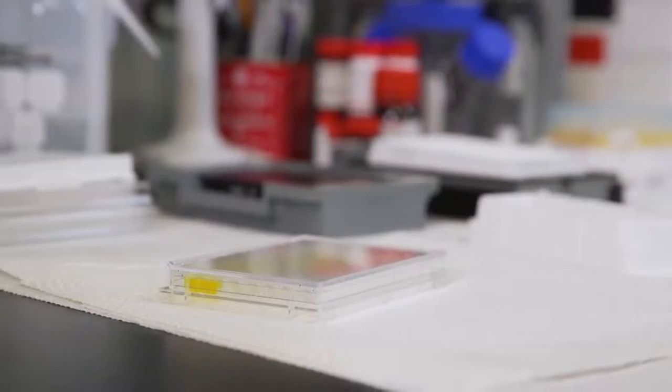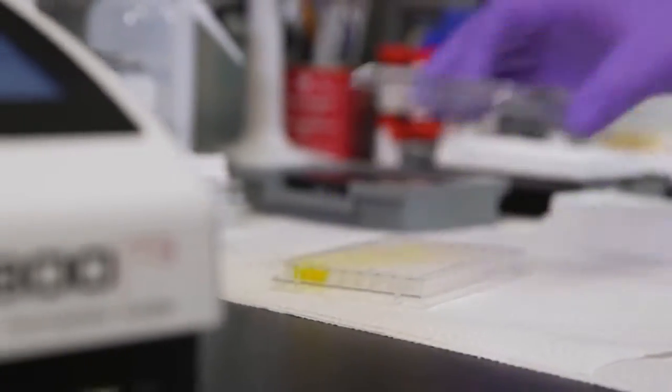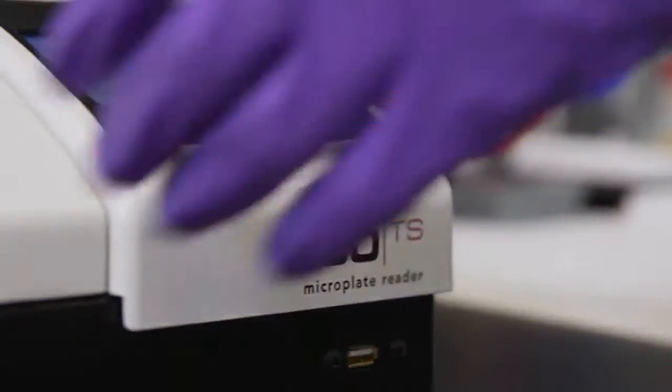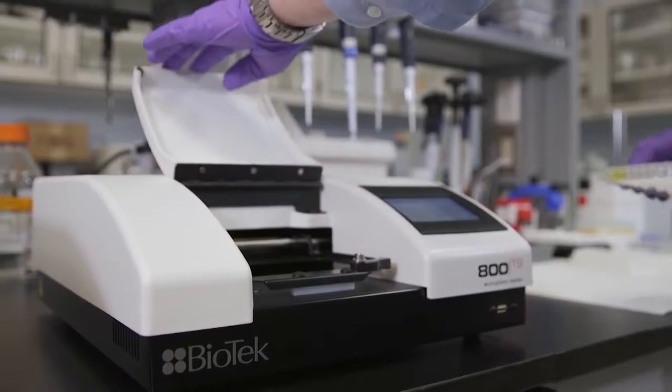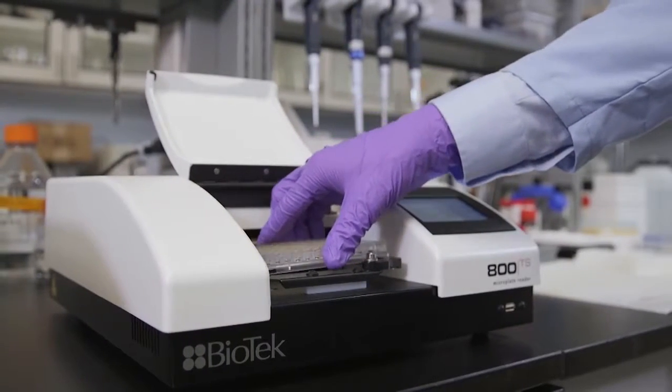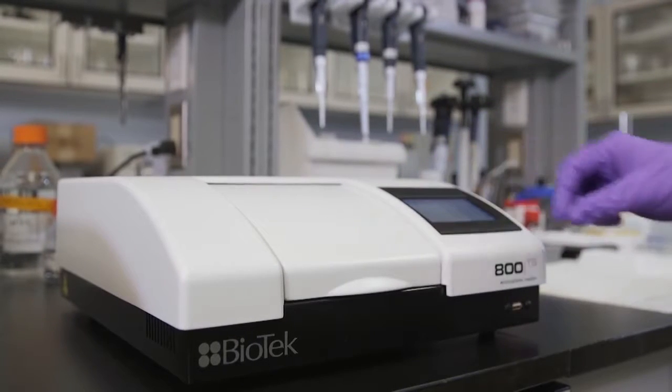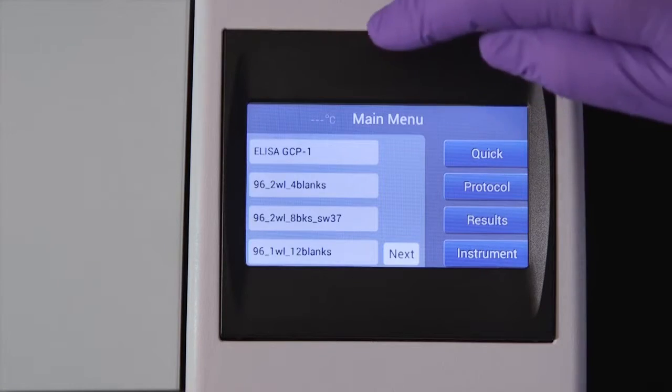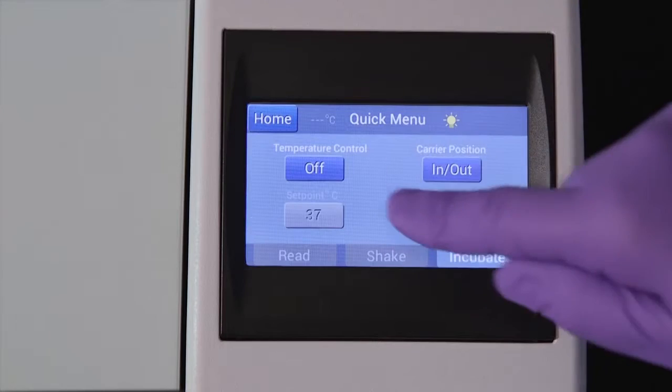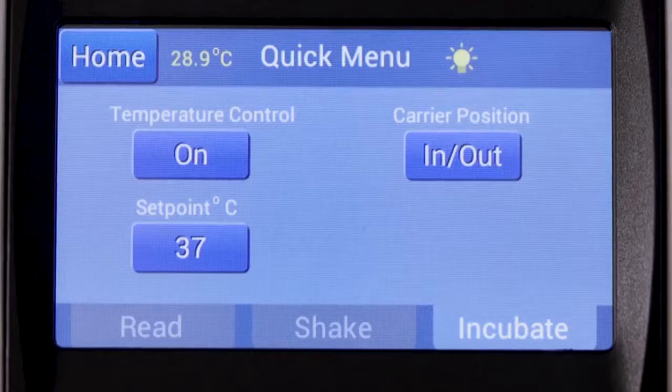With a 340 to 750 nanometer wavelength range, the 800 TS is ideal for a variety of applications including ELISA, protein, and other endpoint protocols. Incubation and shaking expand the reach to enzyme kinetics and cell-based assays.